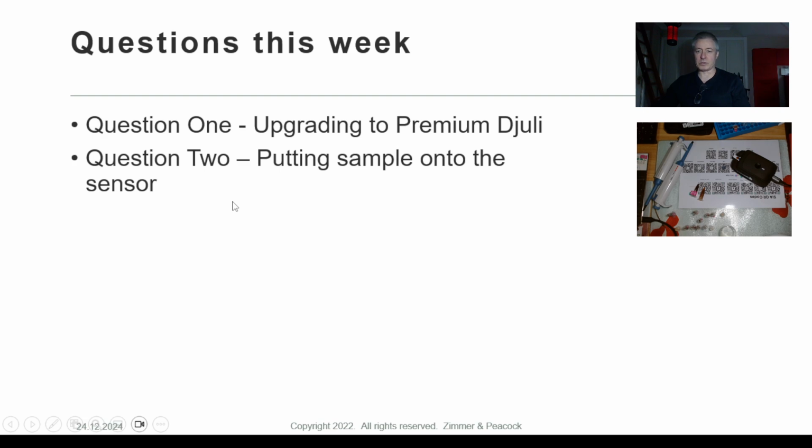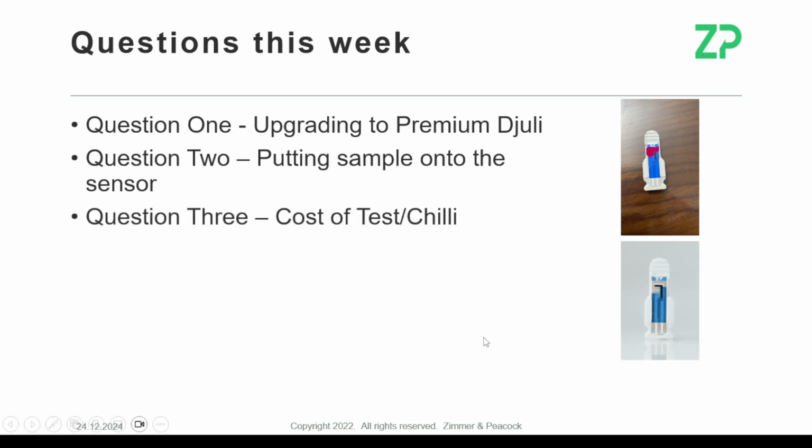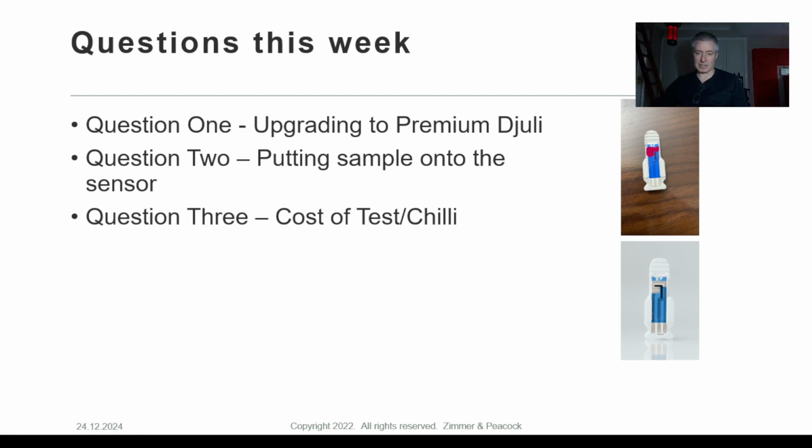I just want to talk about putting samples onto sensors. We did get some images this week and somebody was asking, am I putting the sample in the right place? And the quick answer is you are. But I'm also going to do a demonstration in a minute as well, so that may be helping you. Somebody else who's thinking about onboarding as a client wants to know about the cost of a test, and I'm going to specifically focus on Chilli there.